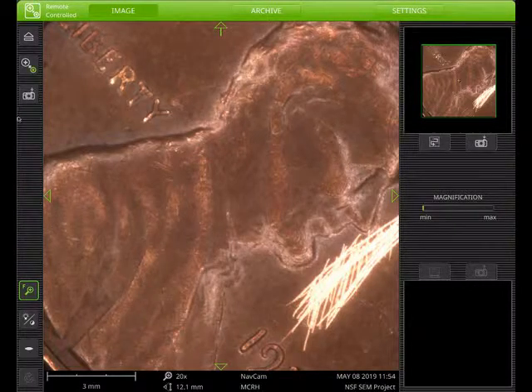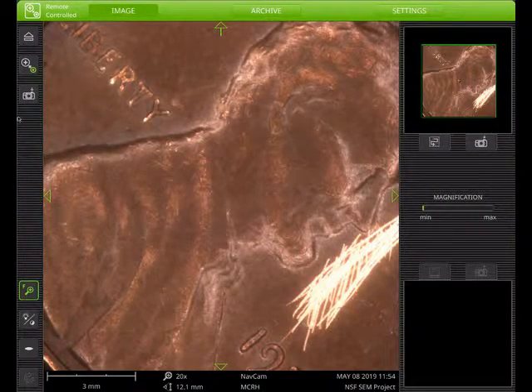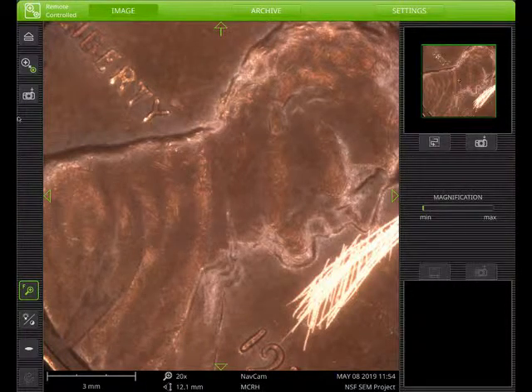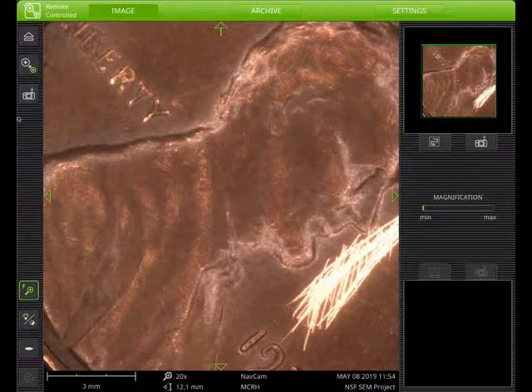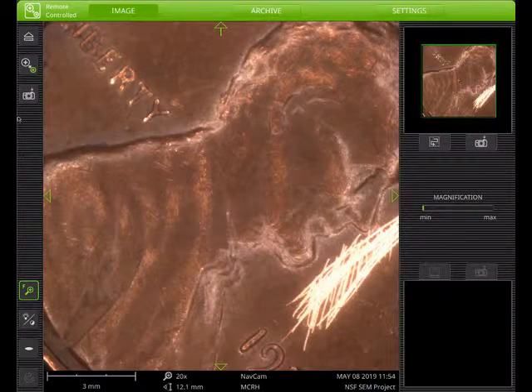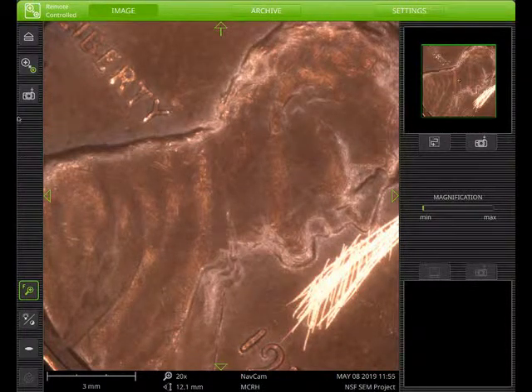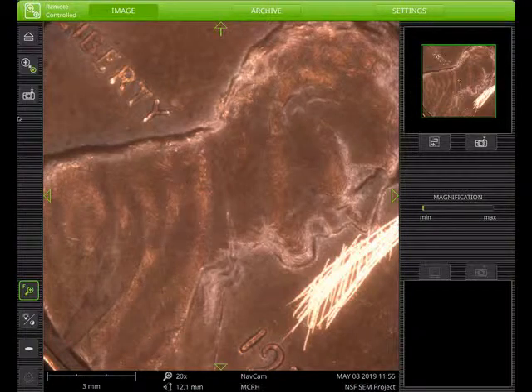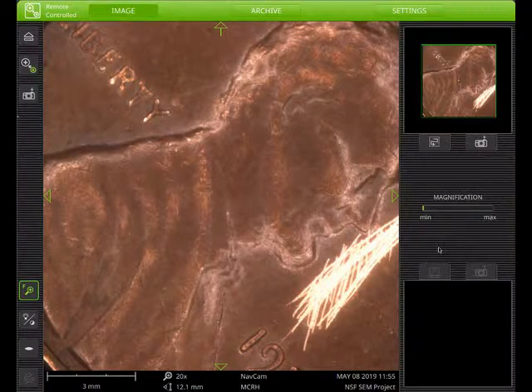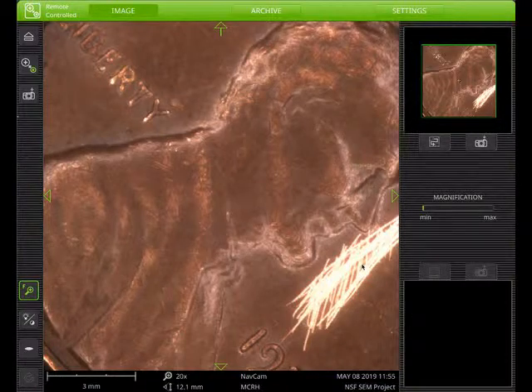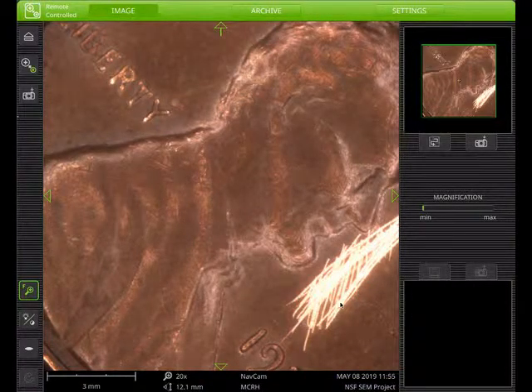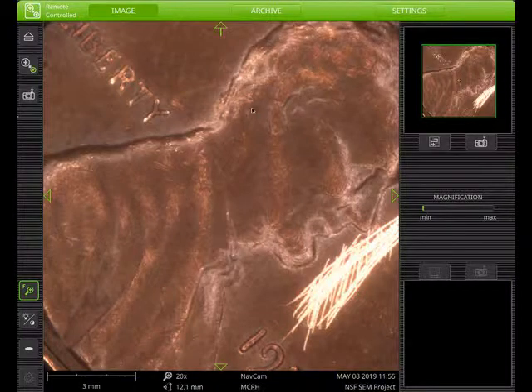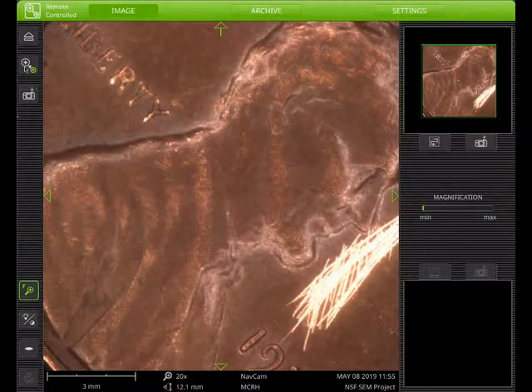You can see this here. It's a color image, regular light image of the penny. You can see that it is a tarnished penny, and I've scratched one area with a razor blade to show the bright pure copper metal underneath. You can see the image twice here. The large image screen is where your working space will be. The upper right-hand corner is sort of an orientation picture, and that picture will actually continue on with us as we move the sample into the machine and begin using the scanning electron microscope properly.